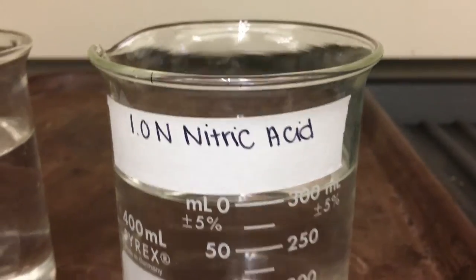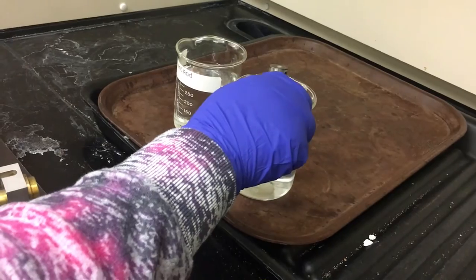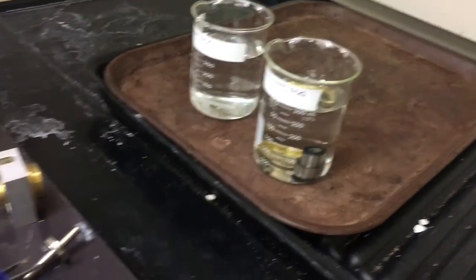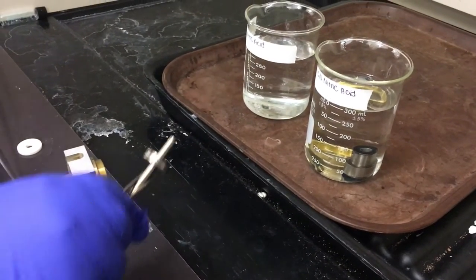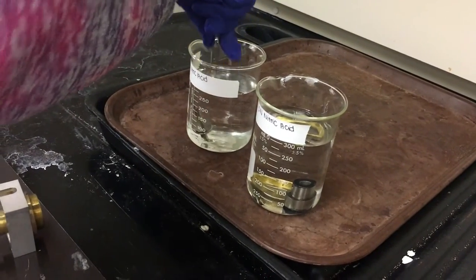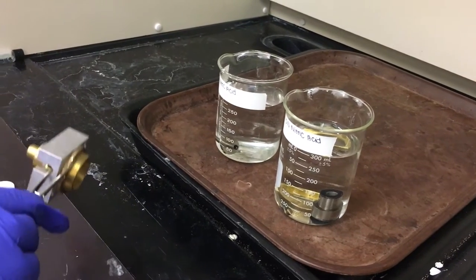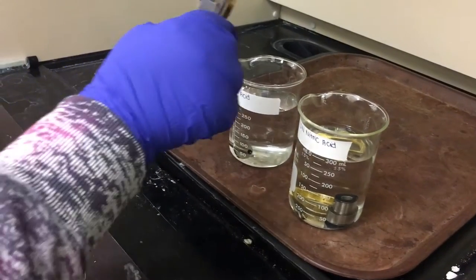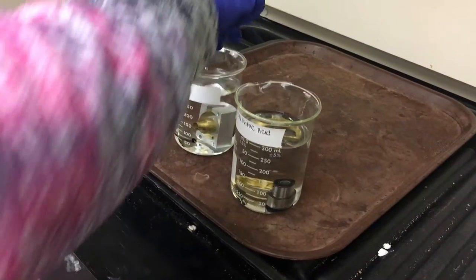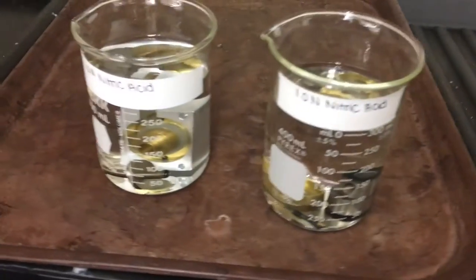One normal nitric acid will need to be prepared for the next step. All non-plastic pieces of the FID unit will need to be placed inside the 1N nitric acid. All of the pieces will need to soak for about a half hour's time.